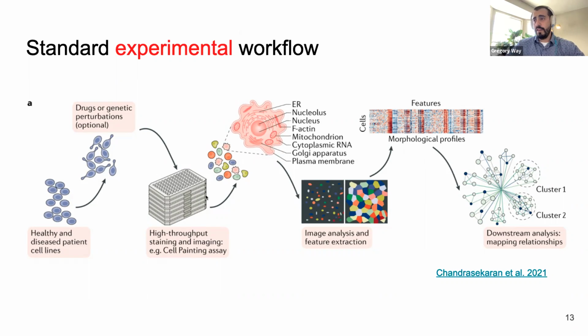And so from this procedure, now, if it's a multiplex imaging assay, we receive images. We apply confocal microscopy to extract images of these cells. And we perform an image analysis and feature extraction pipeline to segment the cells, extract features from these cells, and convert the images of the single cells to a feature matrix, and then perform downstream discovery.